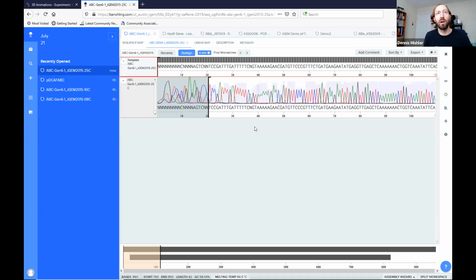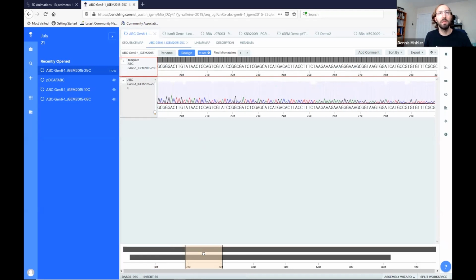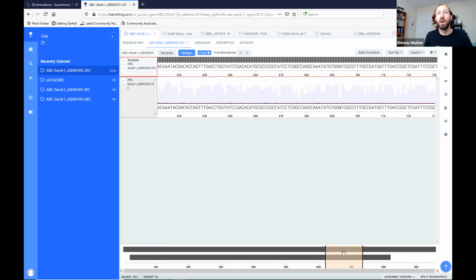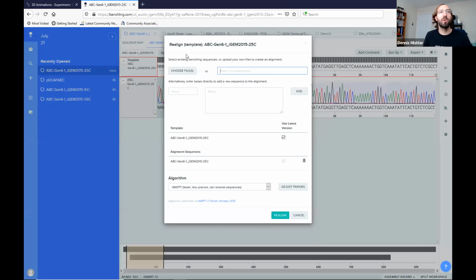And so here's where we're starting. You can see the reads are really, really crisp, really clean. You have these nice peaks. They're very standard, very by themselves. There are in a few places peaks that are sort of clustered. So right here, you can see these two are really close together, overlapping a little bit. Okay. So this though is a good readout to about 700 base pairs. So it's something we can work with. That's important.